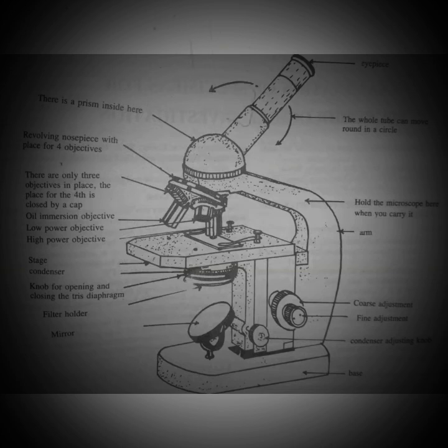So this is all about the components of the microscope, what each part carries and how the parts are described. Now in my next slide I am going to tell you about its different types of microscope. Before going to the types, firstly I want to tell you about the cleaning process of a microscope.